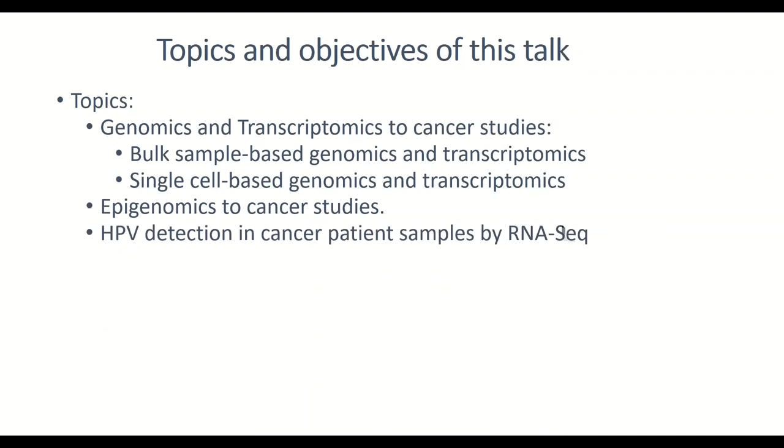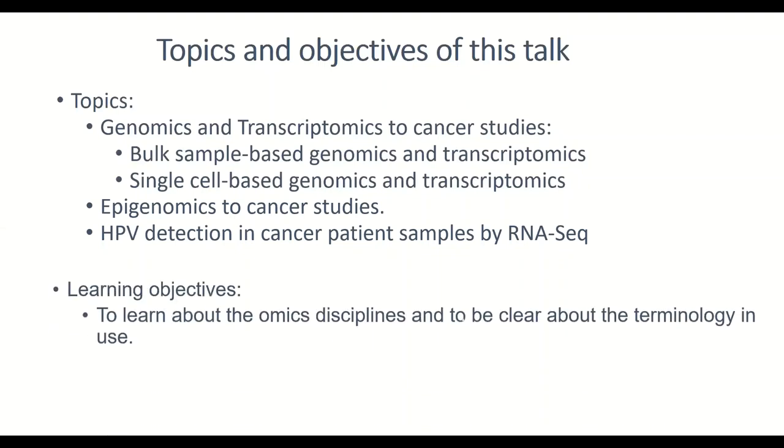The last topic is virus detection, because in our U54 project, virus is an important topic. So I'm going to show you how we detect virus from cancer patients with RNA-seq data. And there are objectives in terms of learning.